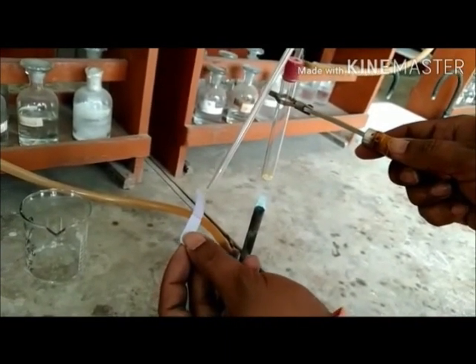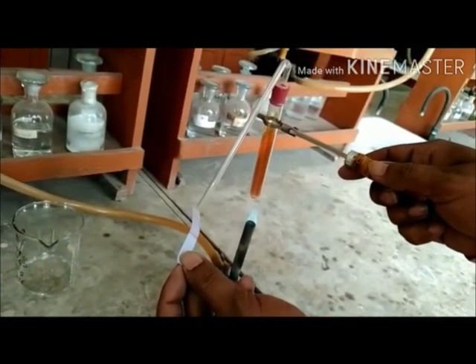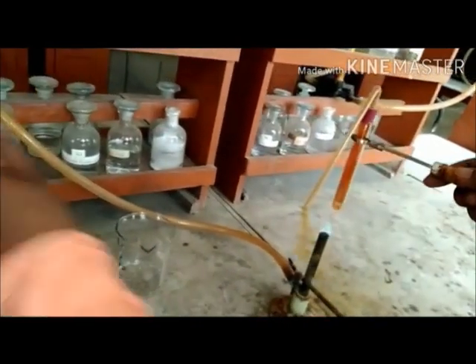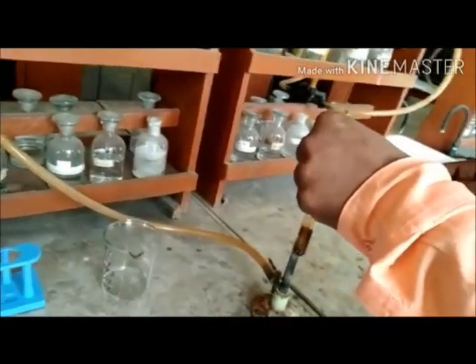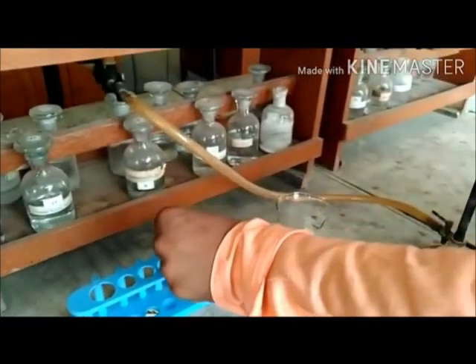Students, you can observe that a crackling sound is produced and a reddish brown gas is being released in the test tube. When this reddish brown gas is made to fall on the moist litmus paper, the blue litmus paper turns red. Now, if we make this reddish brown gas pass through freshly prepared ferrous sulphate solution, it turns black in colour.